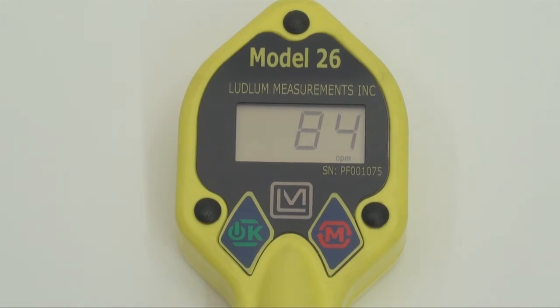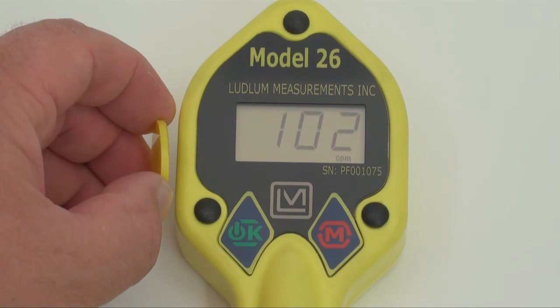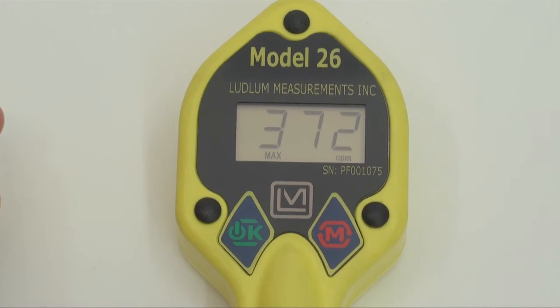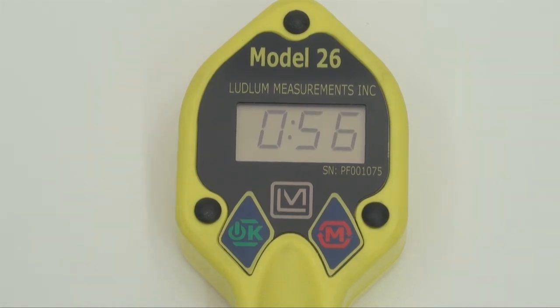The Model 26 can be operated in three different modes: count rate, which shows activity; maximum hold, which locks the display to the highest reading; and scaler, which performs a time count. The modes can be configured to enable any one, two, or all three modes.